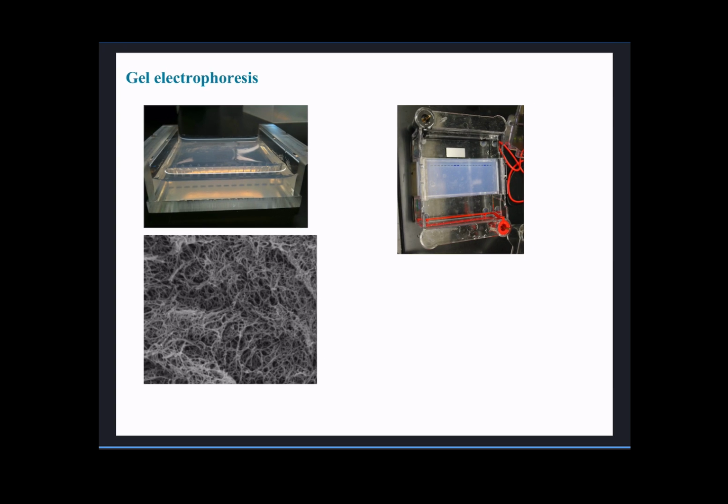And these pores end up forming a 3D mesh, or a 3D sieve, if you will, that will work as a filter for molecules, in this case, different DNA fragments, and it is pretty intuitive. The smaller the DNA fragment, the easier it will be for it to go through these pores. The larger the DNA fragment, the more slowly it will go through them. It will advance through them because it can squeeze. Imagine that even long DNA fragments are ultimately like a string, so you can always thread a string through a small pore, but it will take a little longer. Right? So hold that thought for a second because it'll come in handy later.